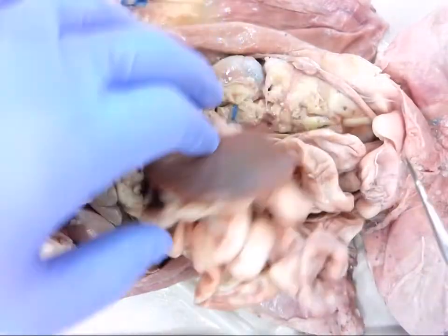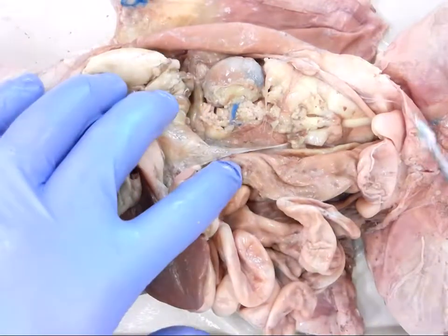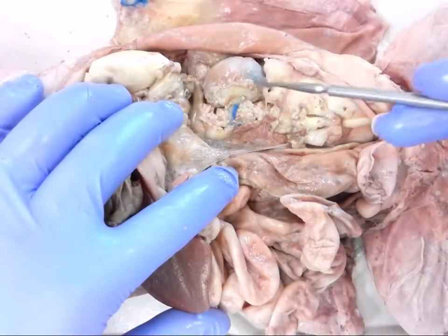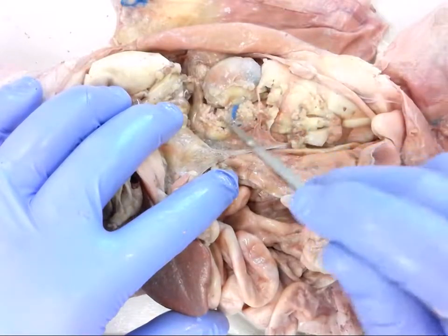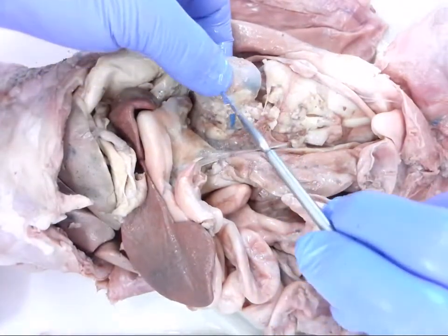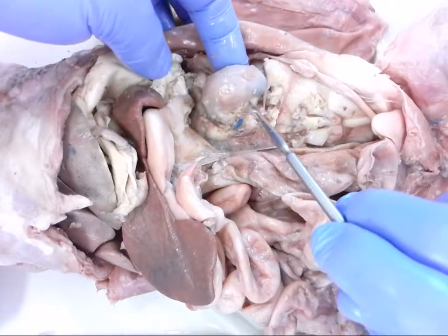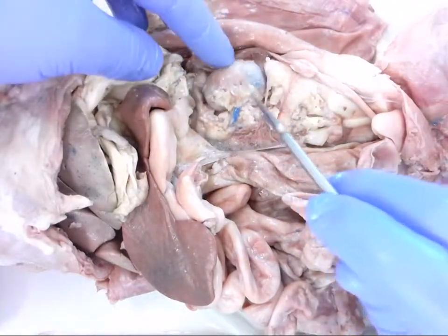We also have, and it's actually part of the urogenital system, or the urinary system, the kidneys. All the time, the kidneys sit against the back wall of the abdominal cavity, and they're covered with fat. I've sort of pulled this one out. It's not great. They're C-shaped, kidney-bean shaped, which is where the kidney bean gets its name, and it sits over here against the side wall.